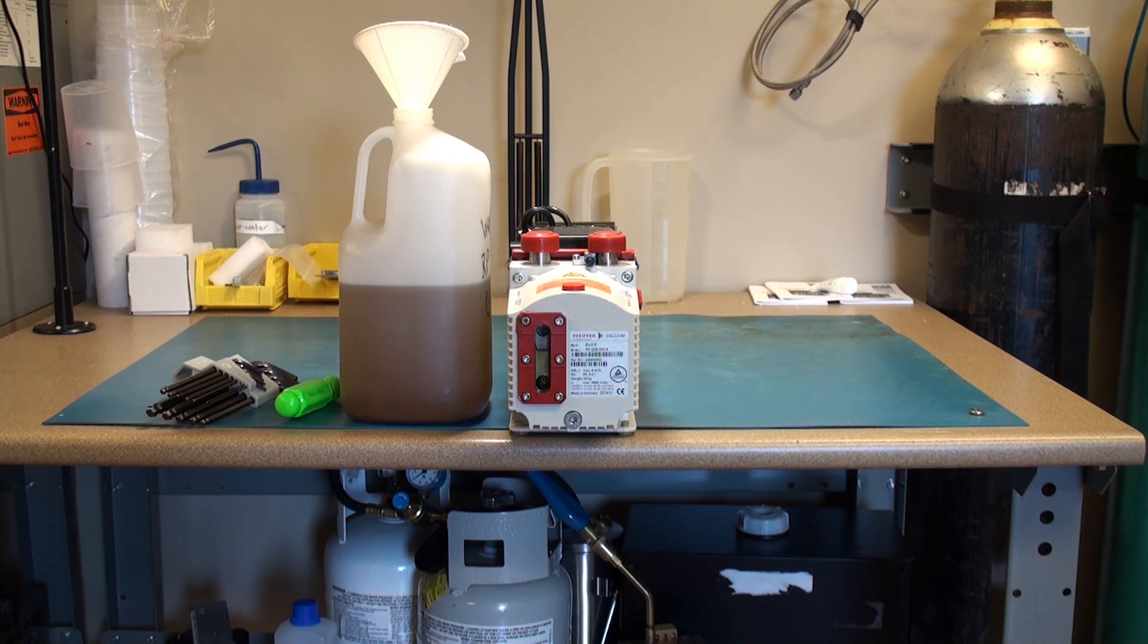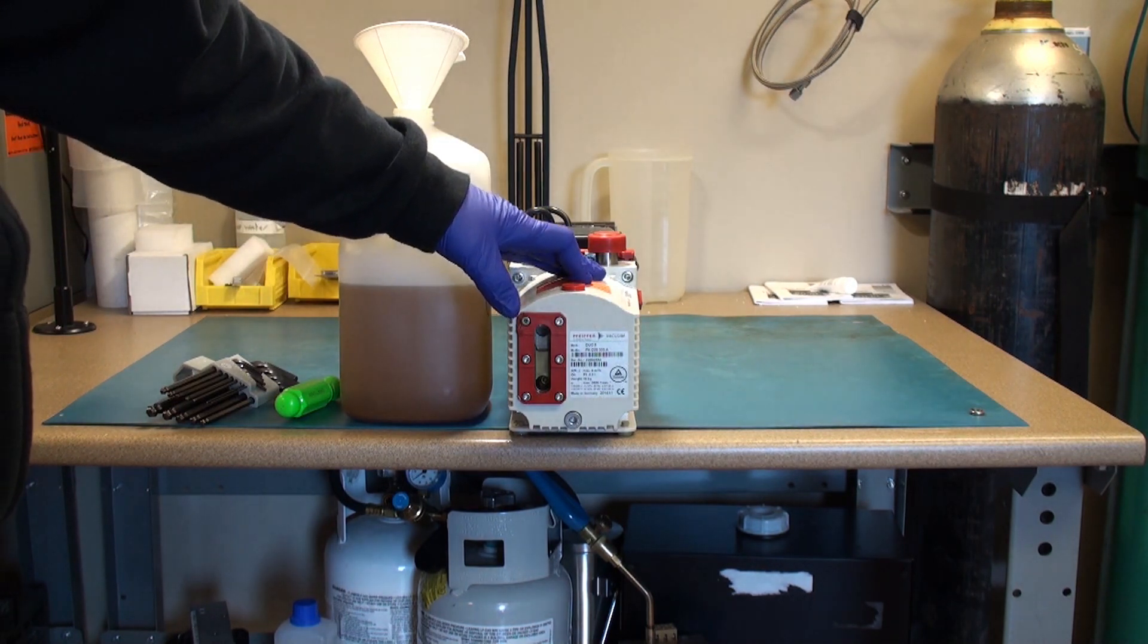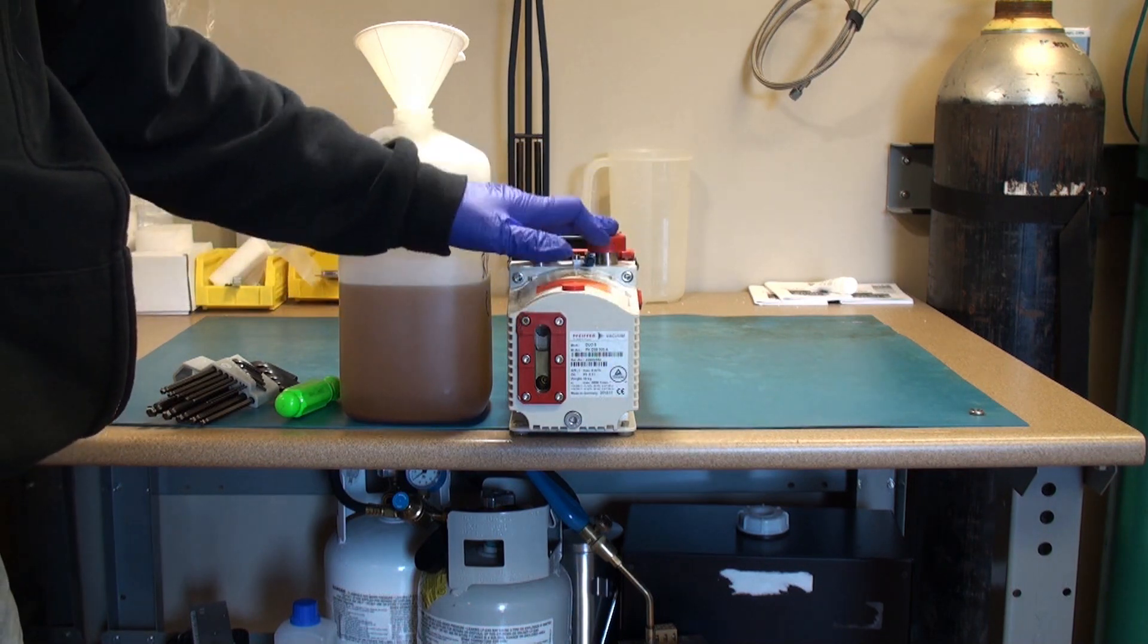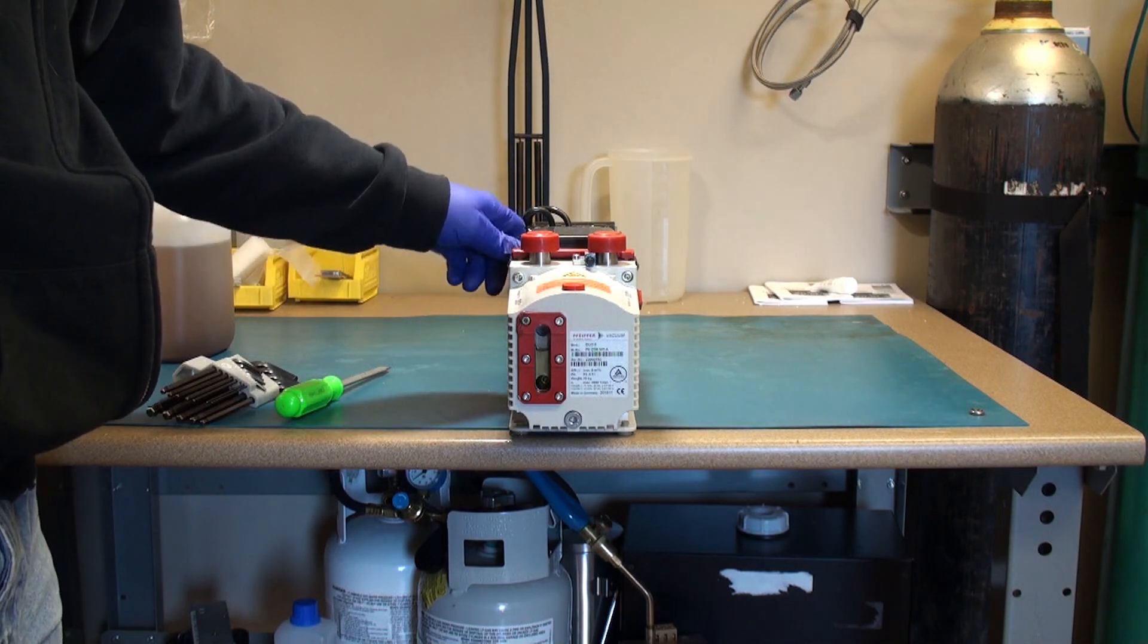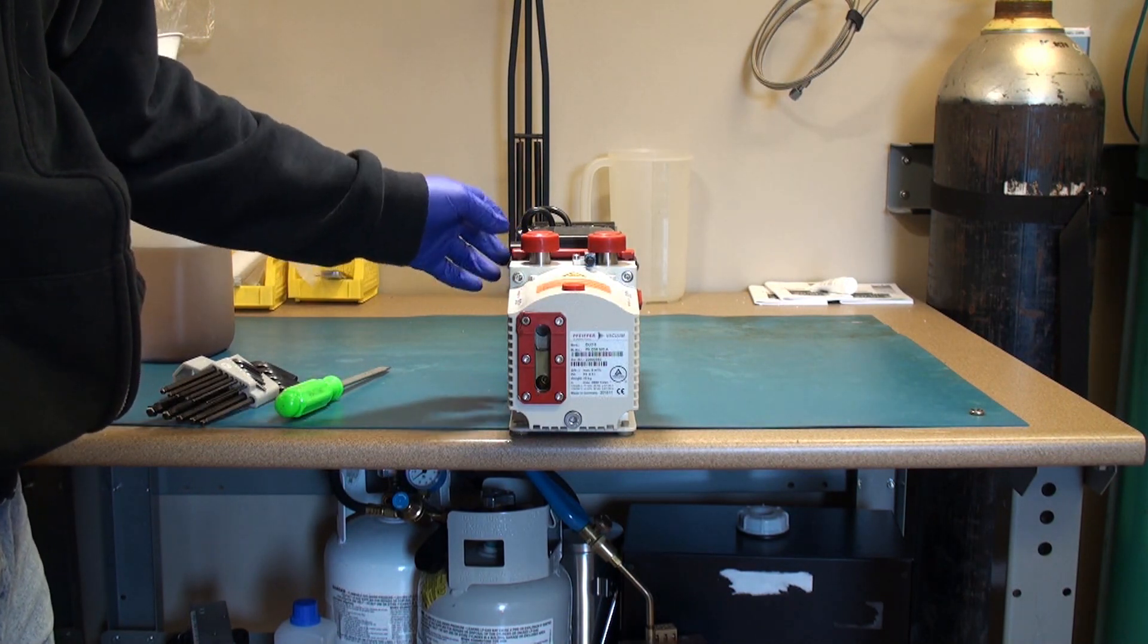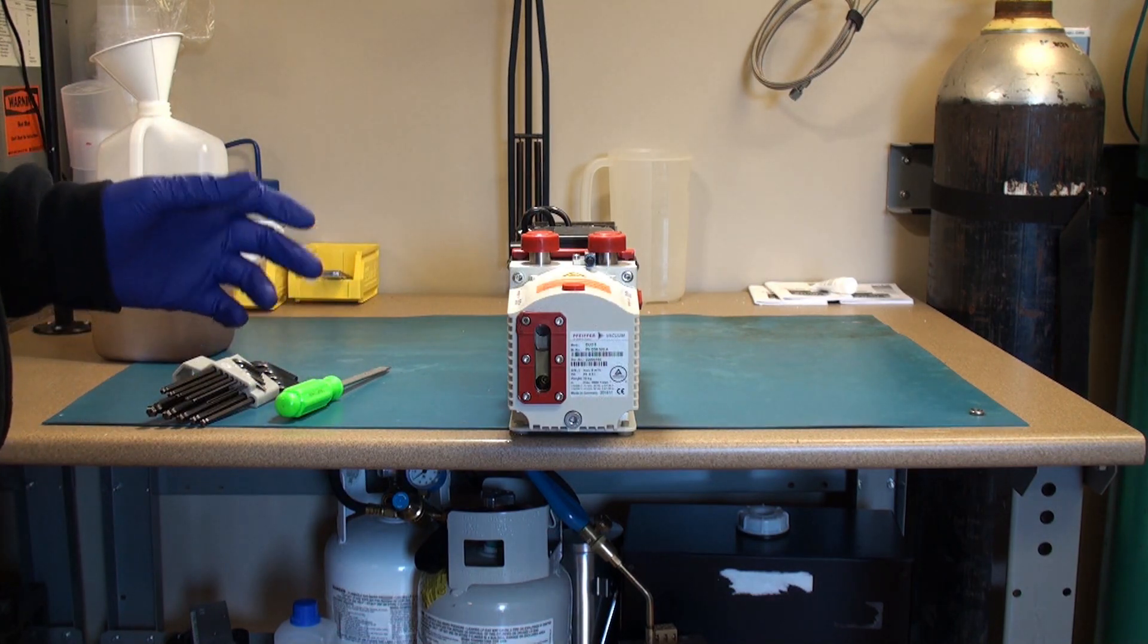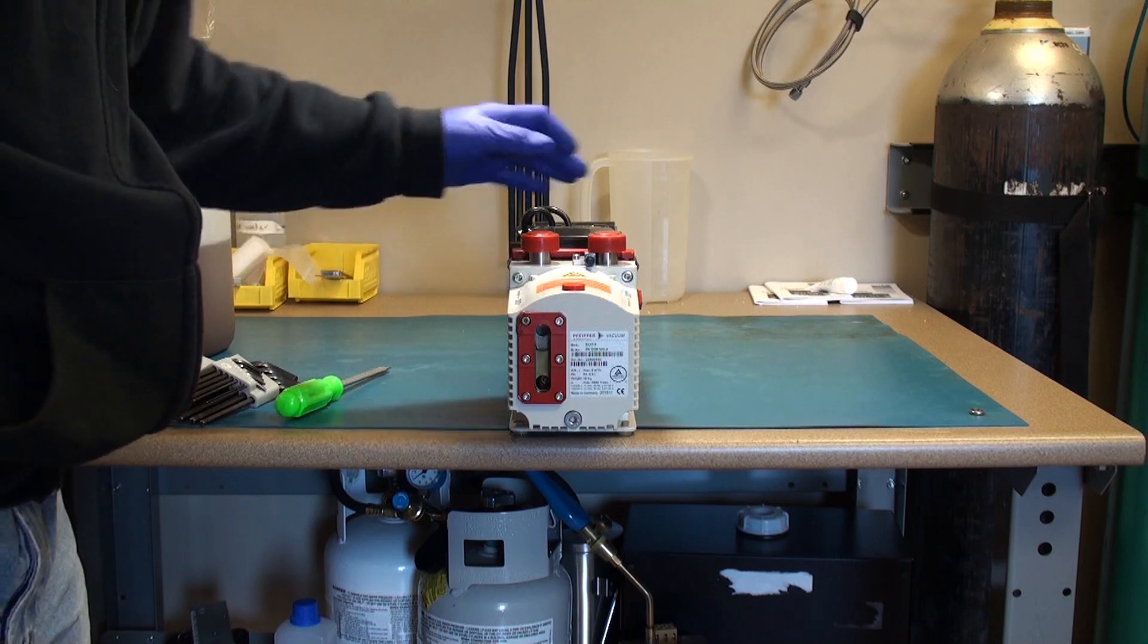The things we have here on the bench is this Pfeiffer Duo 6 rotary vane pump. It has been disconnected from its station where it normally resides near the carbon coater or sputter coater. It's unplugged, turned off.